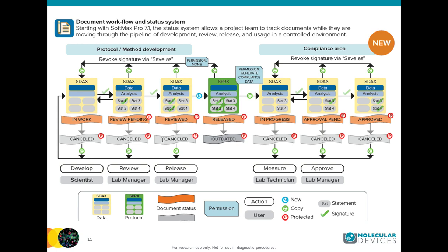Great, thank you. Your next question is, do you expect a difference between 5.4 and 7.1 in terms of rounding and changing final reportable result? It is correct there has been a change in rounding, but in general this change is insignificant for most of the time.